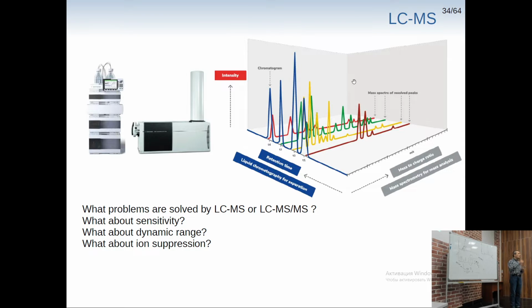For instance, if we have some mass which lies between those peaks, is it possible that we have some, let's say, iron or anything other than our peptides? It's not a protein, so there are no active centers, right? So there is no need to fragment anything if it falls between those gaps, right?